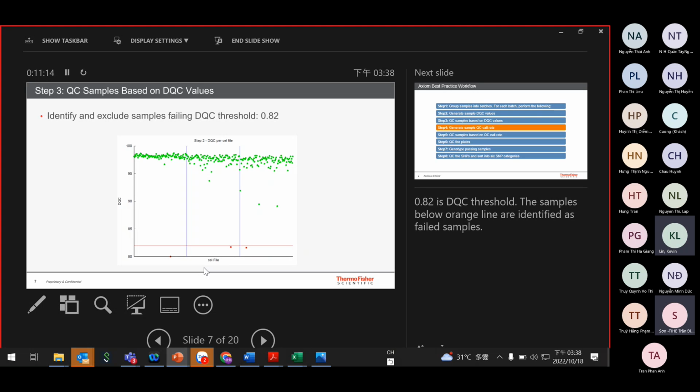What's the common reason for that? Because they do a lot together. Good question. I don't know. Sometimes when they prepare the DNA in a big sample volume, they have some DNA contamination during sample preparation, or during the operation when they prepare the Axiom reagent, like what you have done today and yesterday.